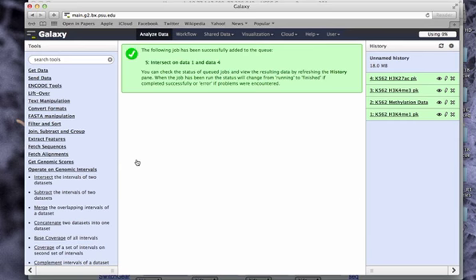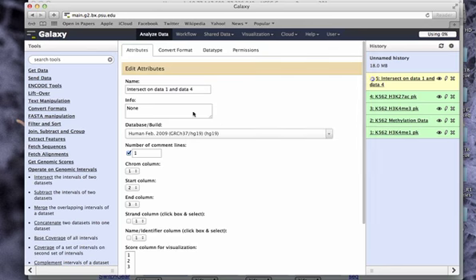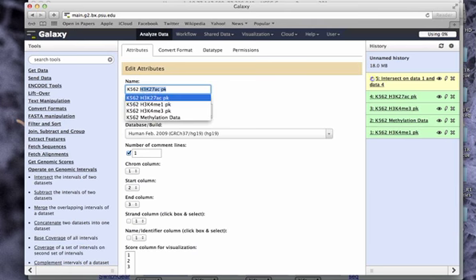So you can start this, and just like when we were getting the data, it will go over here and it will process it. So before it's done though, you can actually change the name, which I would recommend doing for all of your data sets so that you can go back and keep track of them better later. So we'll just call these K562 K4Me1, K27 acetylation domains.